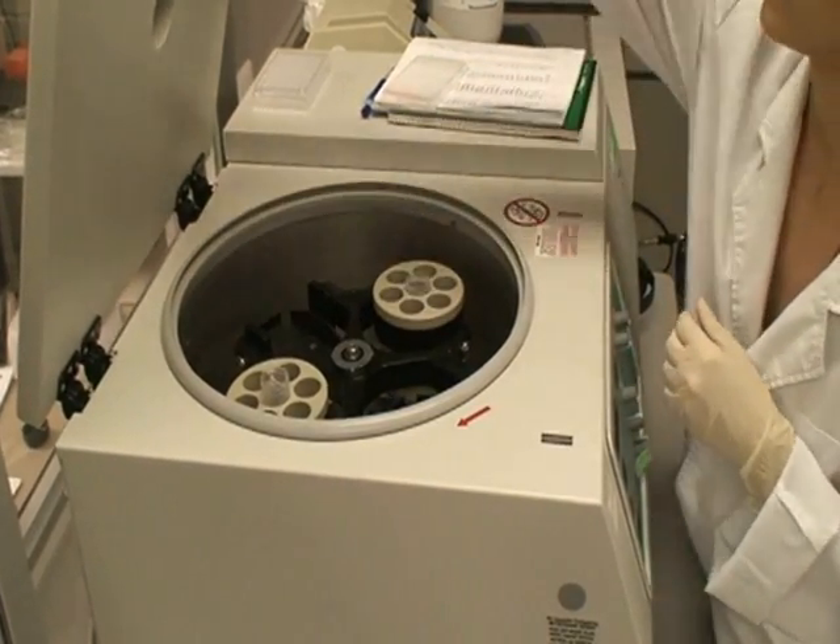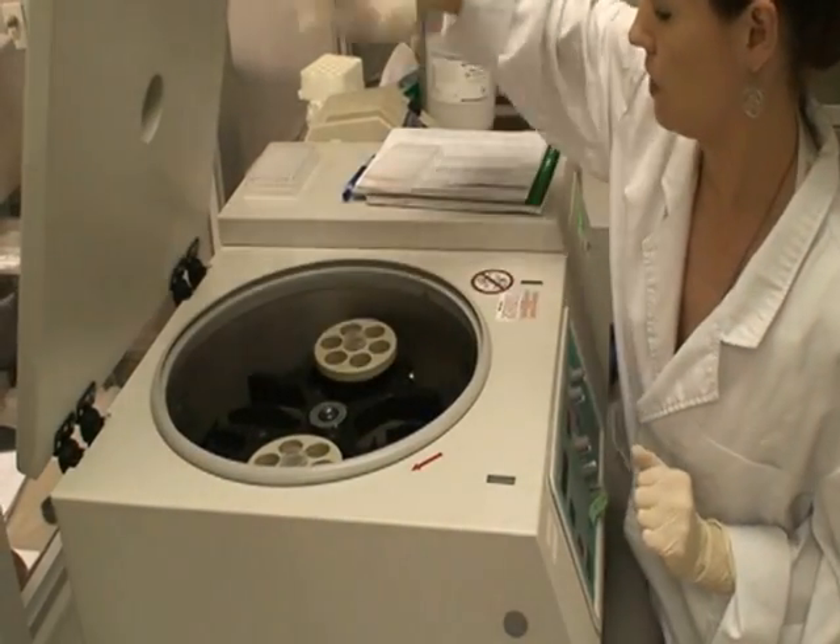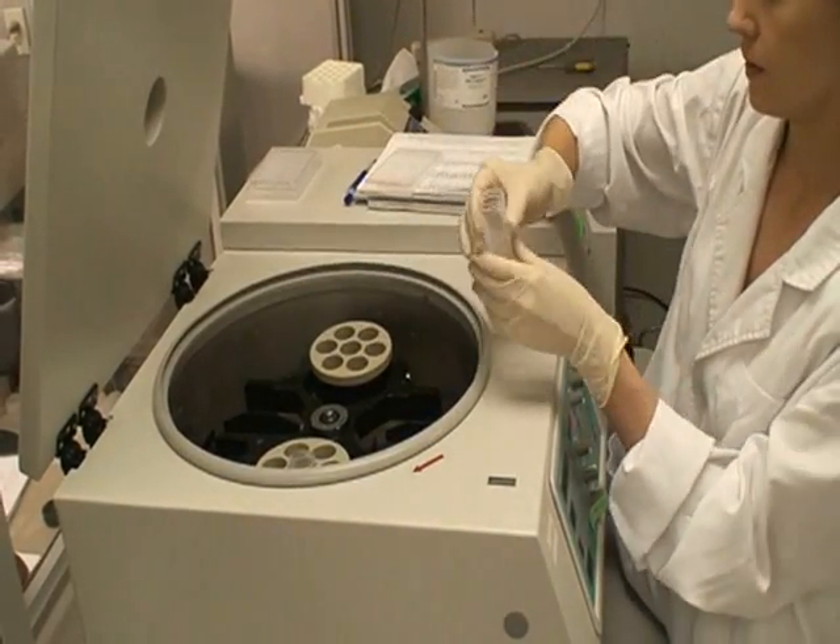Before scanning your arrays, the slide must be completely dry. Water droplets can be completely removed by centrifugation at 1,000 RPM for 3 minutes.